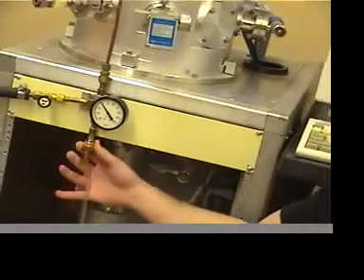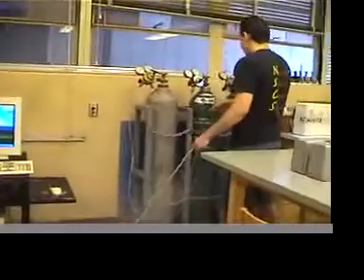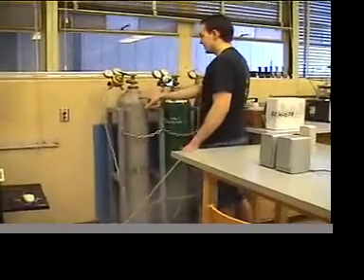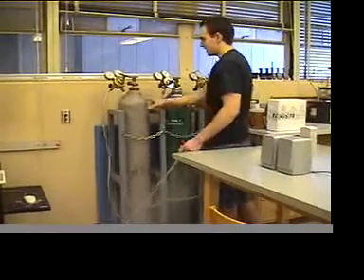Once that's done, you make sure the other end is hooked into one of these three gas tanks. This one here is nitrogen, this one's argon, and this one's balloon-grade helium.